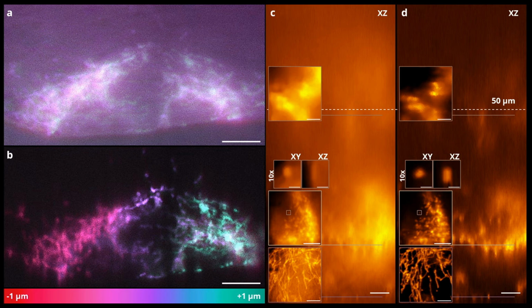So on the right side, there's a small inlay which shows a round little thing. That's a mitochondria-derived vesicle. And that has a depicted resolution of about 300 by 300 by 500 nanometers, and that's pretty much the resolution of the system. What is important, though, is that we can see it in the first place. I needed to actually use the image on the right to find it in the wide field image because it just wouldn't appear otherwise. It was quite difficult to spot.